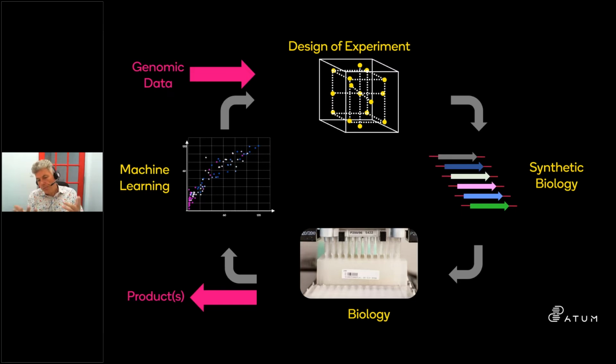Okay, so just a big picture of how we approach this and how we build these things. In silico, we design the biological space, typically using DOE, and this is all done in silico. Say we make a protein, we'll define this separately. Then, having access to gene synthesis, we typically make sets of 96 proteins and synthesize them.